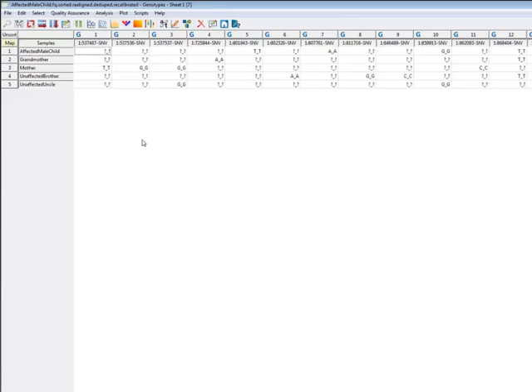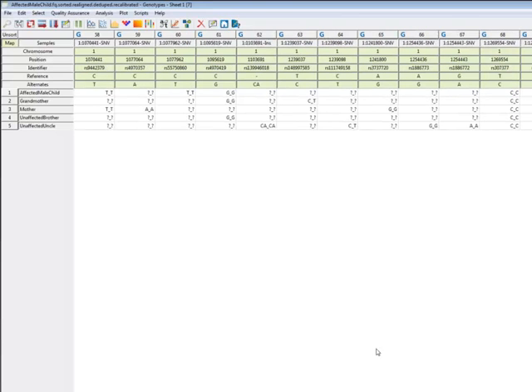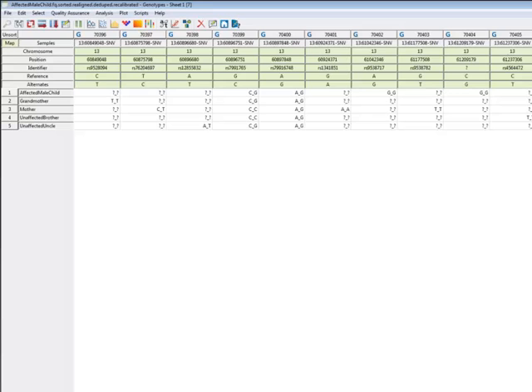So you can see that since we have 5 different individuals that each had their own VCF, there's a lot of missing data. That's what all of these question marks are, where one individual has a variant call and nobody else had data present. And so what we're seeing if we open up this marker map area is one column for every genomic position where at least one individual has a variant call.